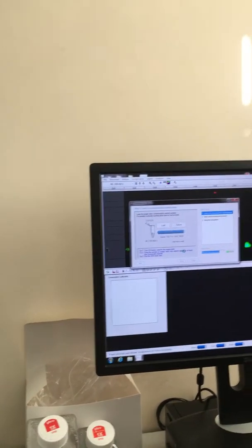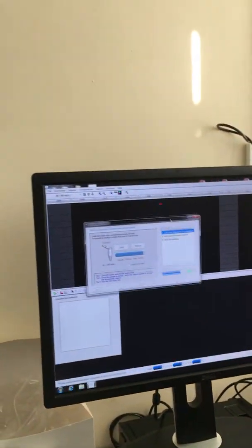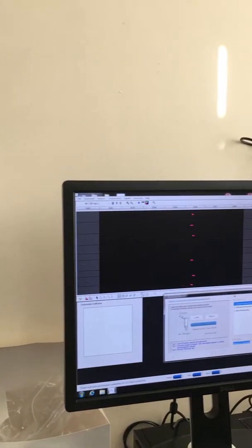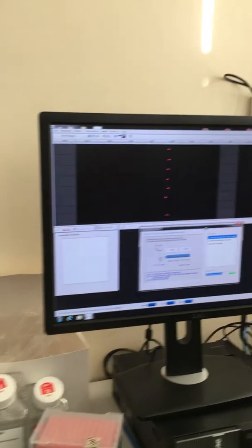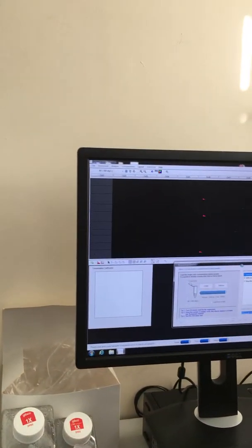So now you're waiting for the instrument. There's a little wizard status here saying waiting for an instrument. Should we drag this one like this? If you like, it doesn't matter. Should we see anything here? No, because this is all beads, and this is not the normal acquisition area.